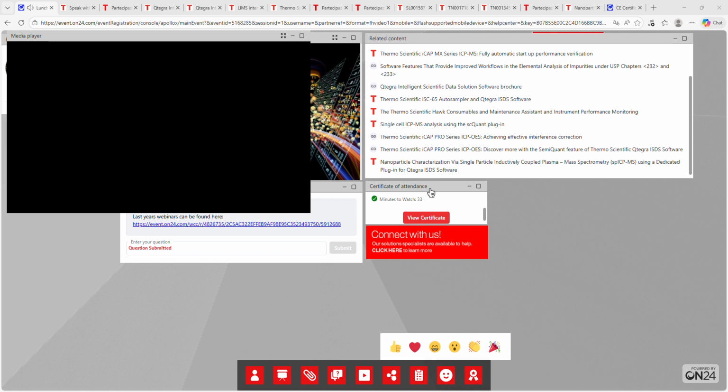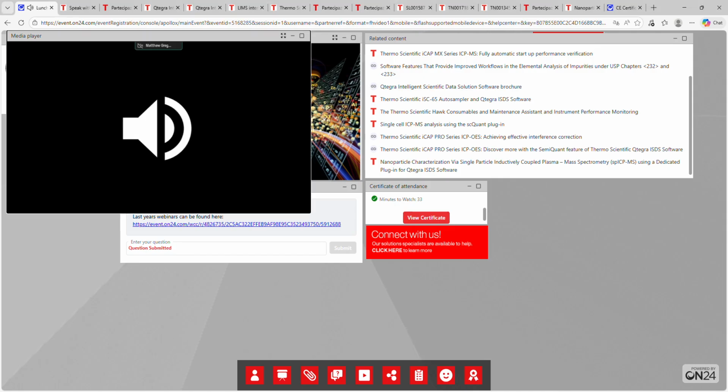Yeah, possibly. There's a couple of reasons why it might be going that high. One reason is that everything is referenced to the blank. So your blank should be called 100%, and then everything relative to that is what it is. So it could be that you have no internal standard in your blank. I don't know if you're spiking it in or adding it online, but if there's no internal standard in your blank, that calls it 0. Then if you have high counts, it's going to call it ridiculously high numbers like 90,000, for example.